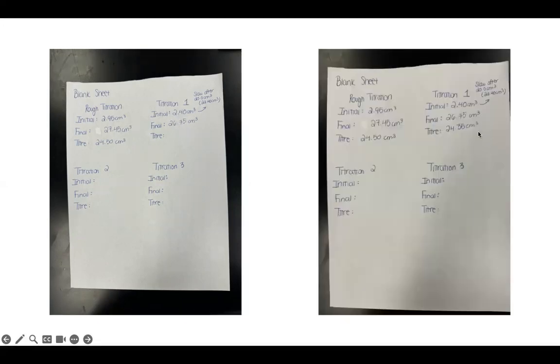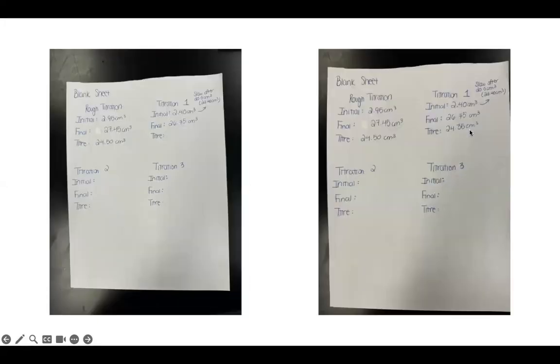And then the titer, or FA2, added. You subtract the final from the initial, and then you get that value here, 24.35 centimeters cubed. Now we will continue with titration 2. So between titration 1 and titration 2, again, you have to clean that conical flask with distilled water 3 times.